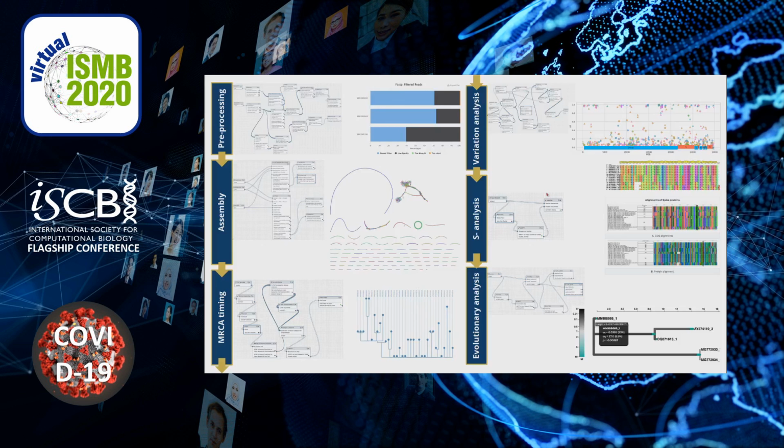If I'm talking about cleaning data, we have especially put some effort into creating a cleaning workflow that will separate human and SARS-CoV-2 reads so that you can be confident that you don't upload human reads to public archives, for example. We also created an assembly workflow that can create a consensus genome, for example, but also a workflow for most recent common ancestor analysis.